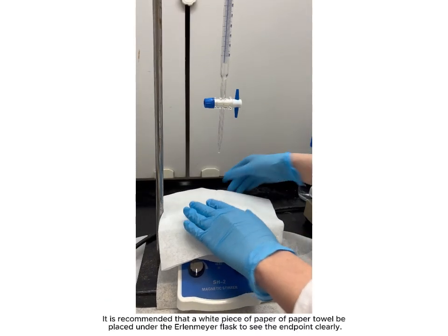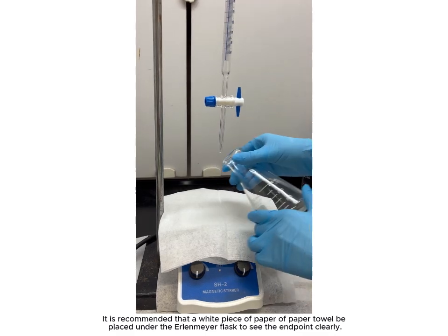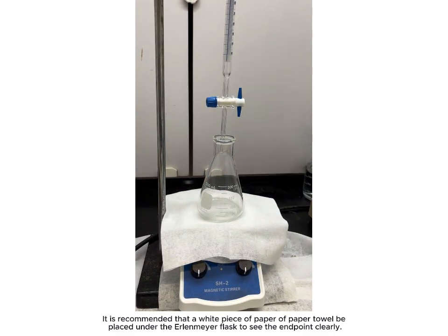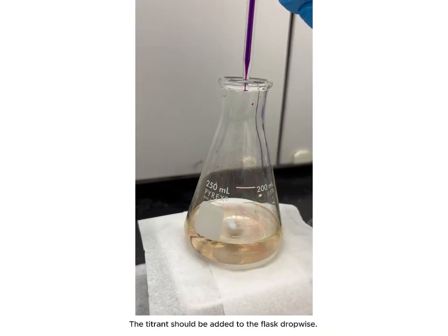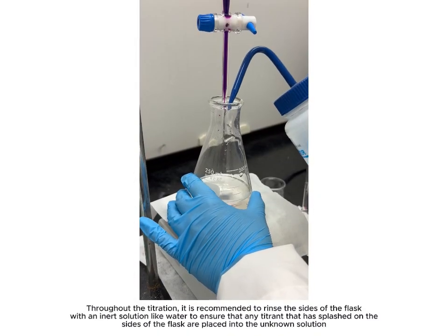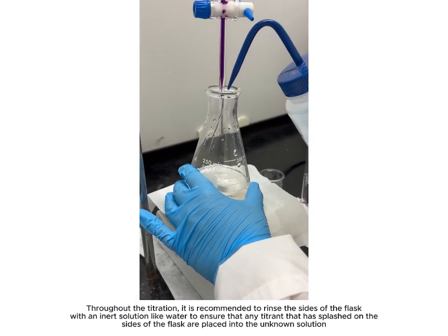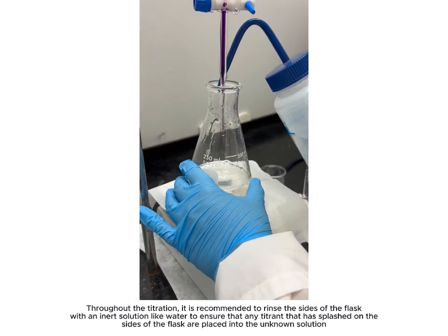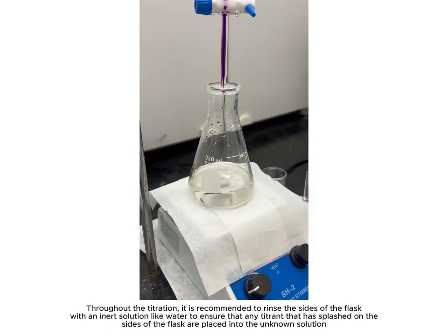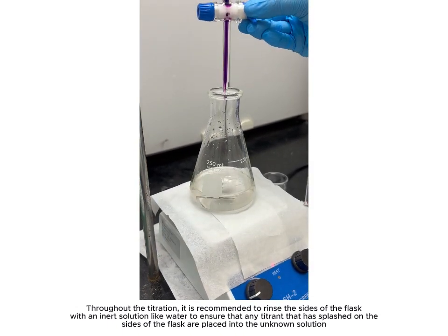It is recommended that a white piece of paper or paper towel is placed under the Erlenmeyer flask to see the endpoint clearly. The titrant should be added to the flask dropwise. Throughout the titration, it is recommended to rinse the sides of the flask with an inert solution like water to ensure that any titrant that has splashed on the sides of the flask is placed into the unknown solution.